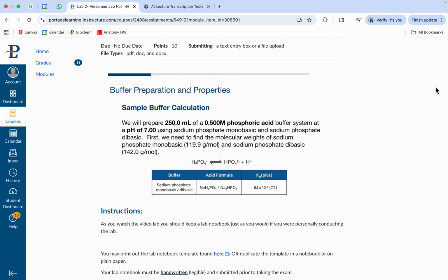All right, in this next part of the experiment, we're changing gears just a little bit, and we're going to look at buffers and buffering. Now, the connection to that last part was that intermolecular forces are the things that occur between water and a substance that's dissolved. There are 2 other substances dissolved in water, so they're all in this aqueous solution.